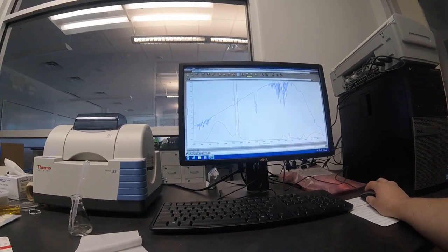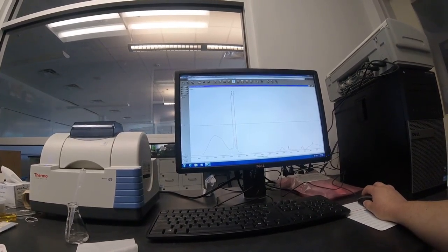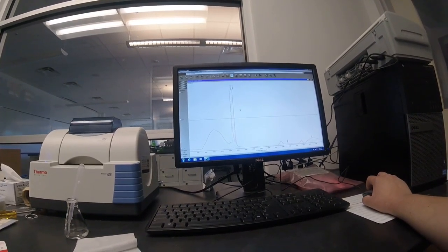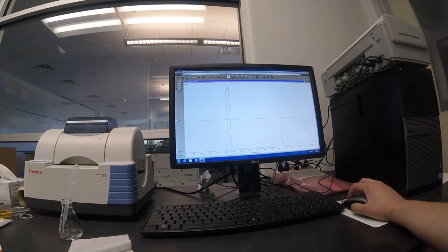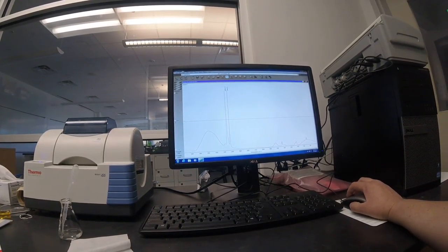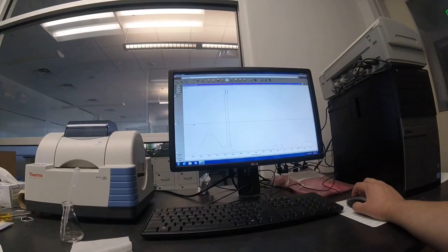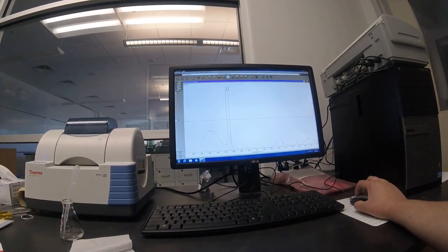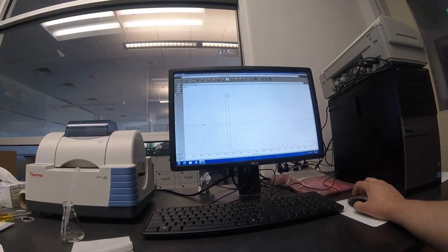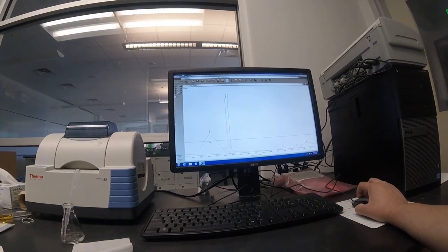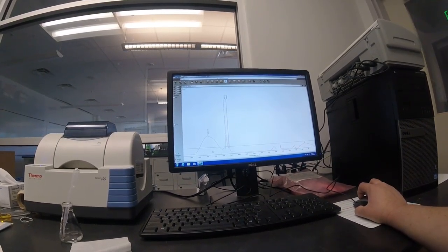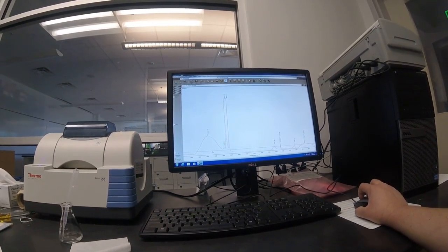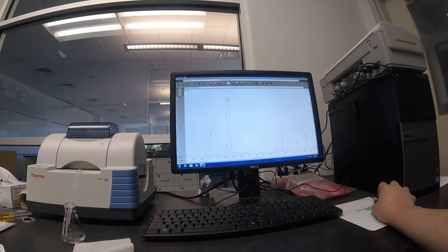And then we can go to where we could say find peaks. And if we want to find the peaks, we just hit the find peaks button. And it sets our threshold at 50, 50 percent. That's the sensitivity. But I want to get this peak down here. So I just bring that threshold, I just click on it, and I set it low so that I get all kinds of peaks found.